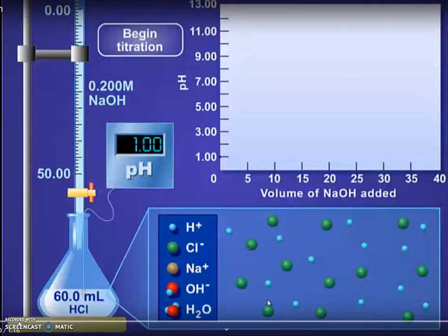The endpoint of an acid-base titration can be determined by monitoring the pH over the titration period. In this example, we see that we have a conical flask with some HCl and our pH electrode in here monitoring the pH. At the moment it's one, which is consistent with that of a strong acid.